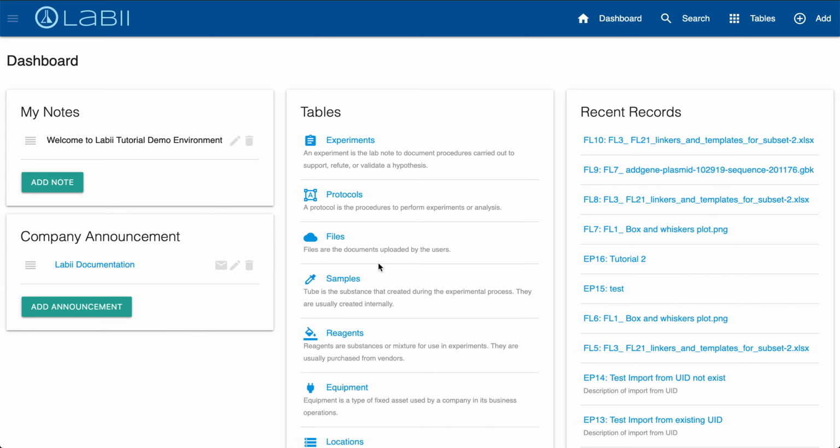They can edit a particular project, view and edit records within the project, and you usually assign this permission to the project manager. The second permission level is edit, and those are the people who can view and edit records within a particular project, and you assign this permission to a project member.